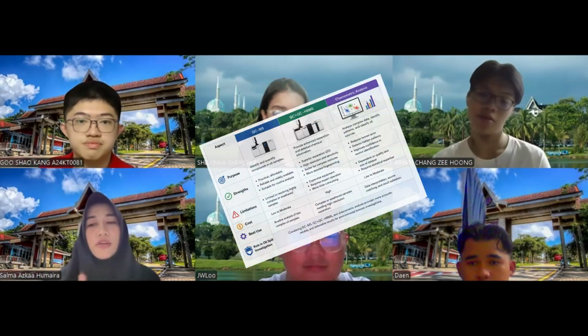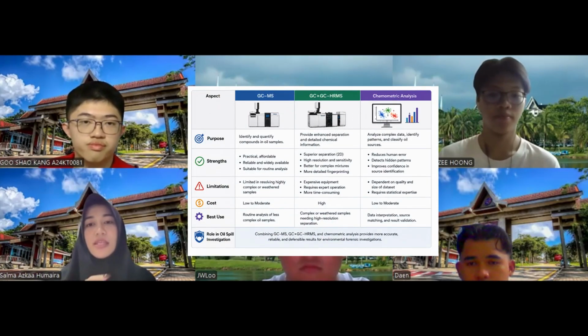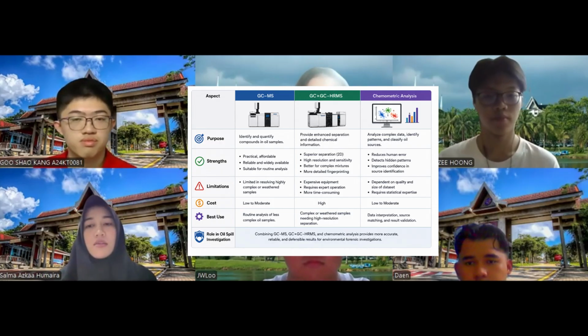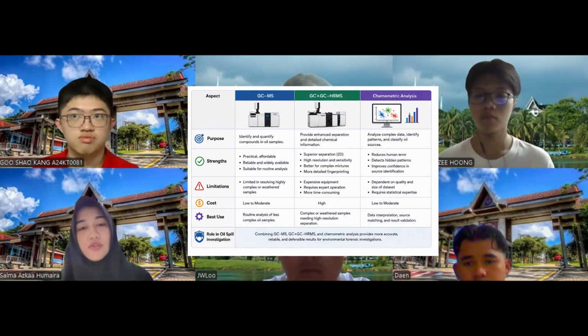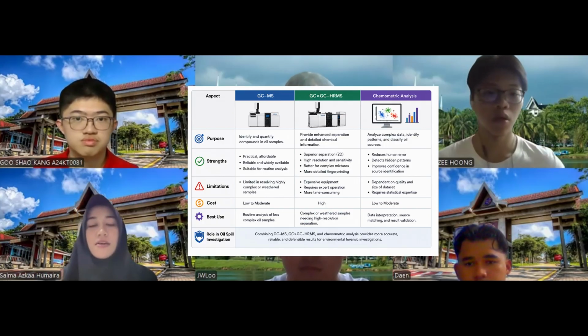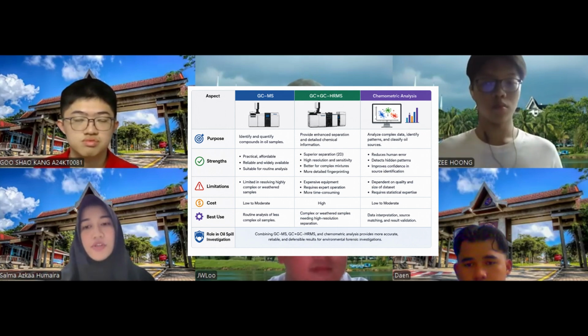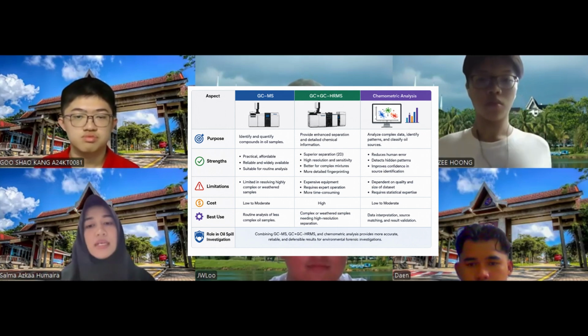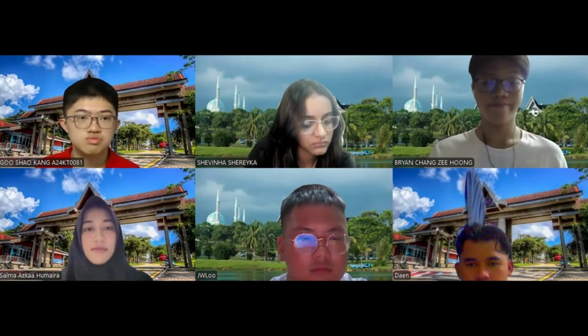Yeah, I think I agree with what Lou and Daen mentioned before. Each technique in oil spill investigation has its own strengths and limitations. GC-MS is widely used because it's practical, affordable, and reliable, but it has limitations with complex samples. GC×GC-HRMS provides more detailed and accurate results, although it's more expensive and requires expert handling. Statistical methods also help to reduce the error and improve the confidence in identifying the oil source. Therefore, combining these three techniques will give more accurate and reliable investigation results.